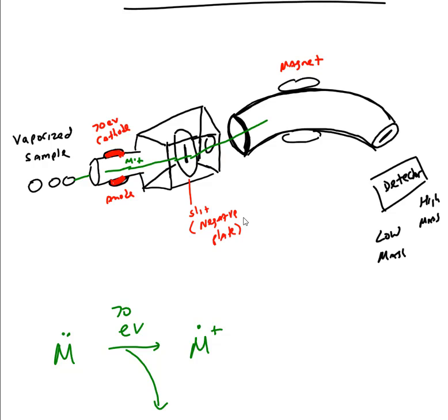You'll keep going, and eventually you'll find your way into this magnetic field. As you pass through this field and turn, you either hit this wall, or you can keep going straight through and wind up here. The heavier molecules are going to wind up hitting the wall at the top as they turn. The lighter elements, or lighter fragments as we call them, are going to hit the bottom of this plate over here, or go out and come in through the light side over here.